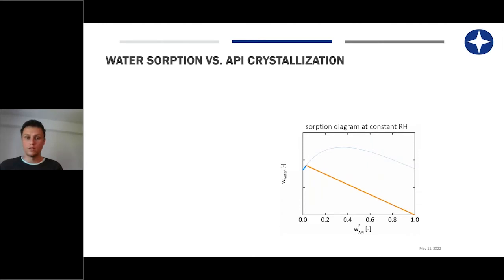And if we now convert that to an application and want to learn, as I said initially, about the crystallization behavior, nucleation, and crystal growth in an ASD, we need to understand the sorption profile of the fully amorphous and crystalline state. For example, at 70% drug load, we will first of all have a mass increase to the blue line and then a decrease to the orange line.